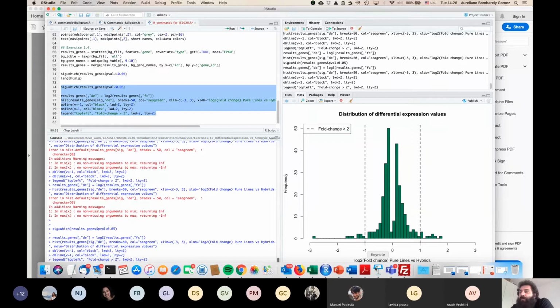Another example where you can use p-values is when you are working with trees and it's difficult to have good biological replicates. The differences you're going to see are such that at some point these Q values are not going to be useful because you have too much variance between the samples. But as I said, my suggestion in this case is to always use Q values. And if you run Q values and you have 0 differentially expressed genes, that is when you need to think about using P values.